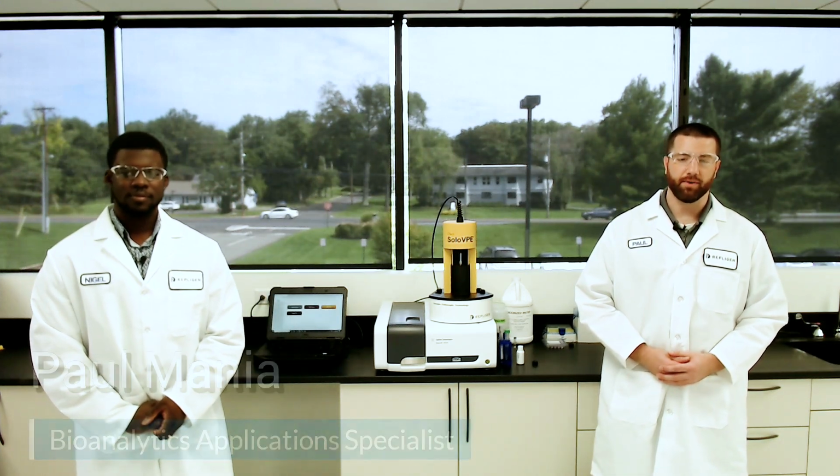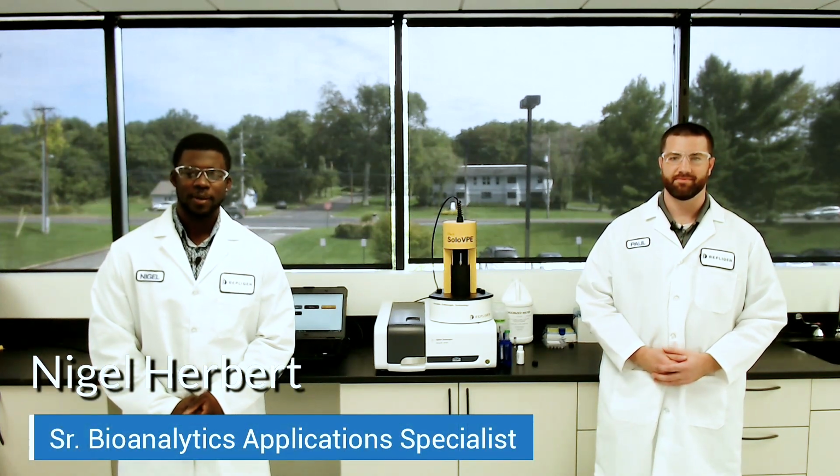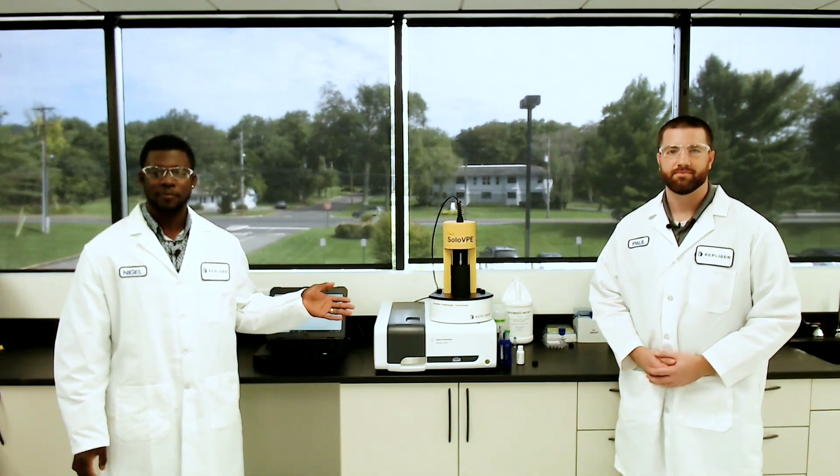I'm Paul Mania, Bioanalytics Application Specialist, along here with my colleague, Nigel Herbert, Senior Bioanalytics Application Specialist. And today we are going to demonstrate the SoloVPE system for you. We're first going to go through a brief presentation, and then afterwards go through a live session of running some samples.